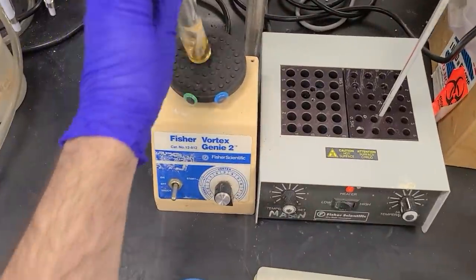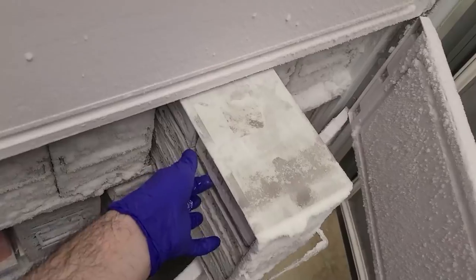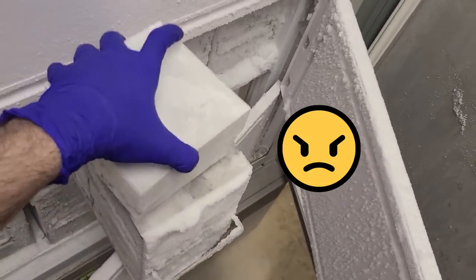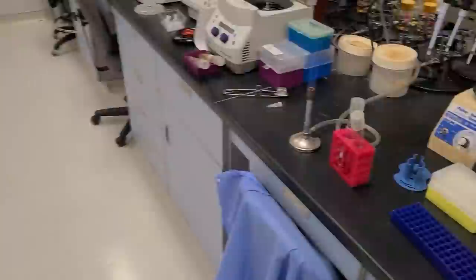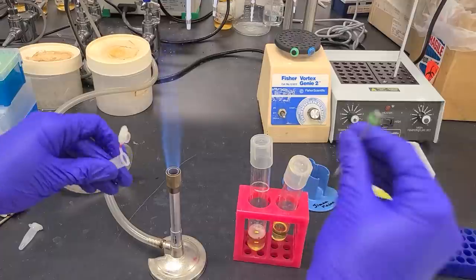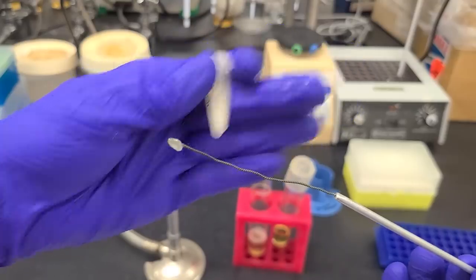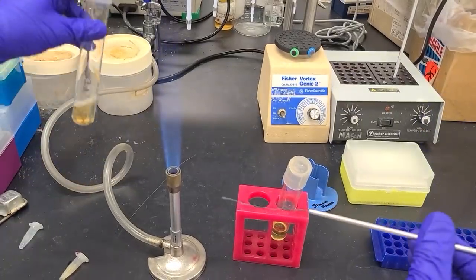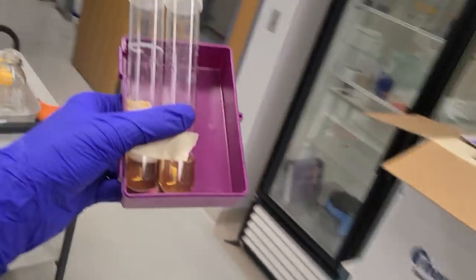Mix it all up. Frozen bacteria. So after this inoculating loop has been sterilized, die bacteria, die. Then I take a little bit of the bacteria that are frozen in this tube. And I'm going to put the bacteria in one of these tubes, but I'm not going to put them in the other one. This will show that the liquid itself isn't contaminated with bacteria.